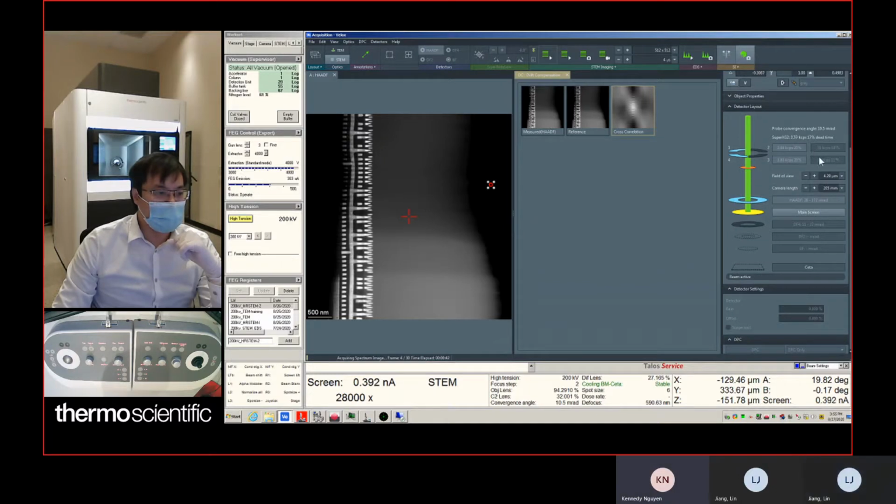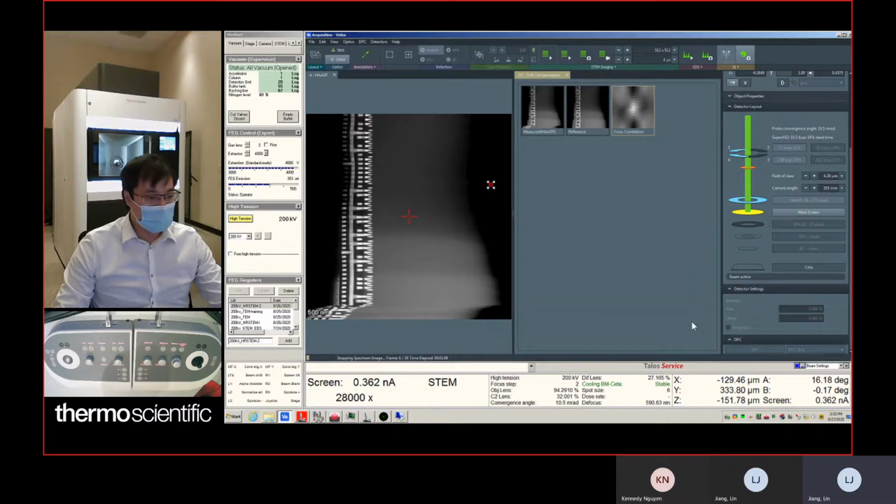So I guess we're tilting toward 2 and 3. Yeah, we're tilting toward 2 or 3 because right now the 2 or 3 get a lot of counts, right? Yeah, and then normally if there's no tilt, it'd be at 10 or what? Normally for super apps, we don't need to tilt. Yeah. So we can tilt it back to see how it looks. We can tilt it back to 0. Because right now, because we're tilting on this side, we're getting more counts from that side.